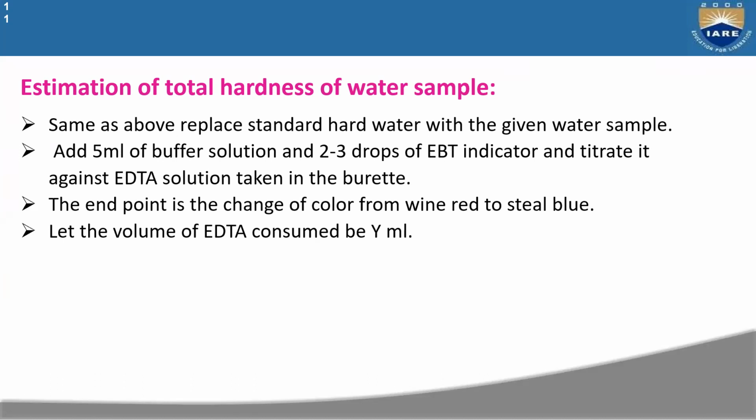The burette contains EDTA solution. So the end point is the color change from wine red to steel blue. Let the volume of EDTA consumed be y ml.